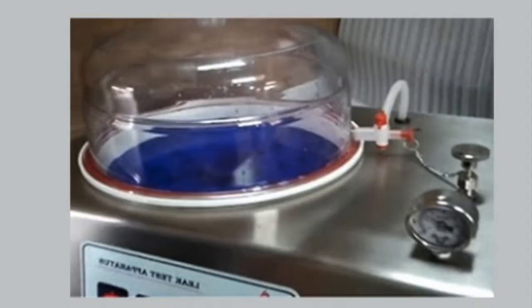Generally, methylene blue solution is used, and it is autoclaved at 121 degrees Celsius for 10 minutes under pressure. Later, the containers are observed to see whether color has entered the container. If the color appears inside the container, that means there is a leakage and it fails the test.